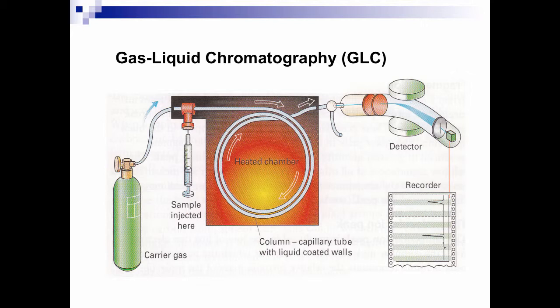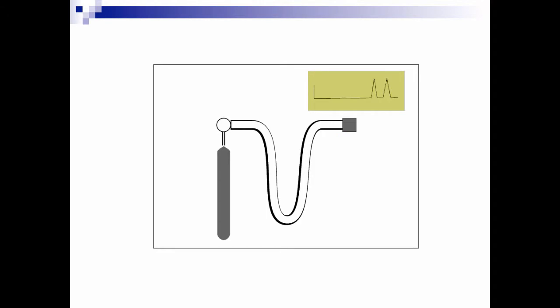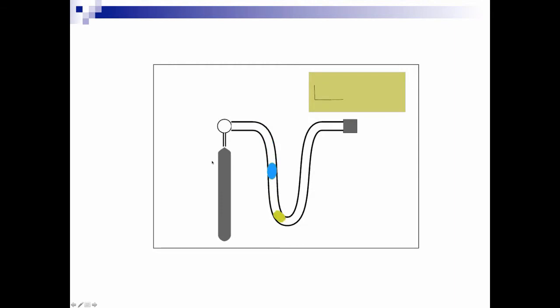As you can see here, there are a total of 2 components in the analyte. This particular slide depicts a portion of the column, and as you can see represented by the gray arrow here, it represents the hypodermic needle.